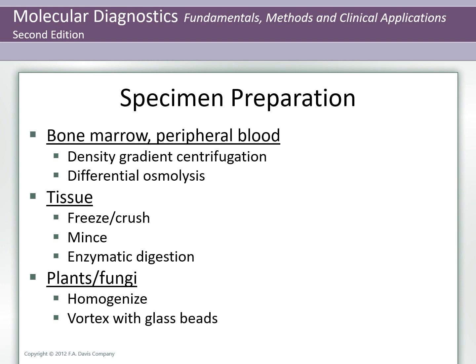Incubation of whole blood or bone marrow in hypotonic buffer or water will result in lysis of red blood cells before white blood cells. The white blood cells are then pelleted by centrifugation, leaving the empty red blood cell membranes and hemoglobin, respectively, in suspension and solution.